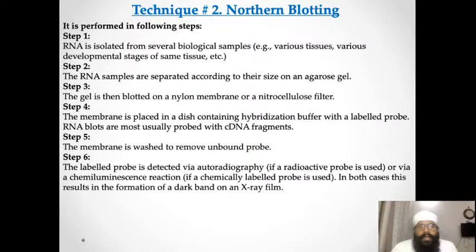Then it is performed in these six steps. So first, RNA is isolated from the several biological samples. Then RNA samples are separated according to size on agarose gel. The gel is then blotted on a nylon membrane.